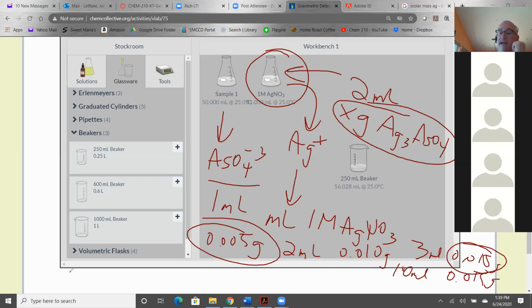Oh, right. Then yeah, whatever it is. Once you get to the maximum, you only need to do that calculation once, the mass percent. You can do it next to 3, or you can do it next to 10. It doesn't really matter. But you have to prove that that's the maximum amount of precipitate you're going to get.